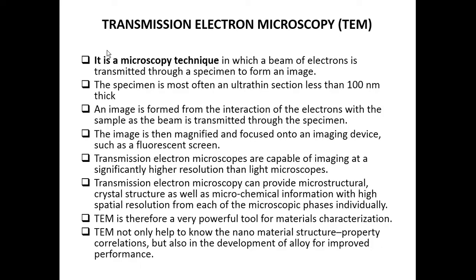My dear students, in the last class we discussed the scanning electron microscope, its working and its applications. Today we are going to discuss another type of electron microscope, named transmission electron microscopy. And what is the basic difference between the operation of SEM and TEM, transmission electron microscopy? That also we will discuss today.